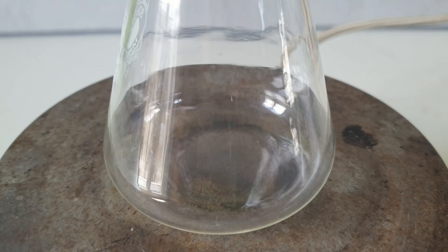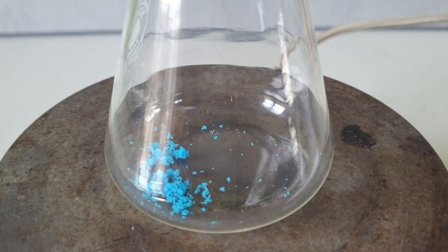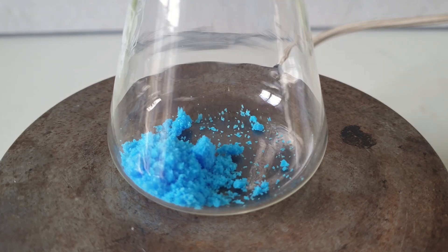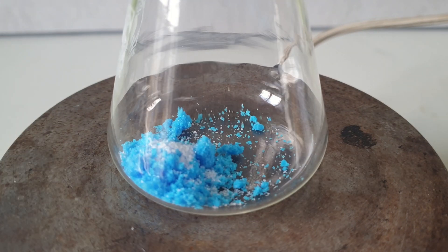To make it I added 4.15 grams of copper sulfate pentahydrate and 2.5 grams of glycine to an Erlenmeyer flask.